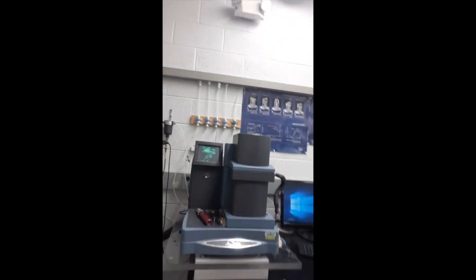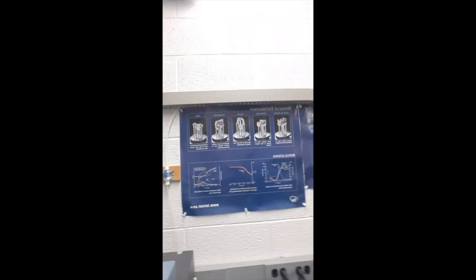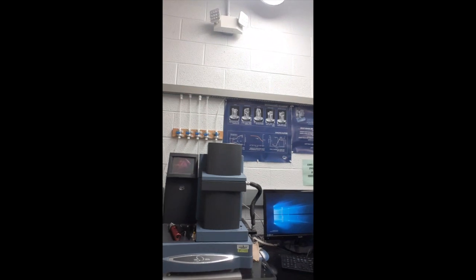Another instrument that I like to use is called our DMA, or dynamic mechanical analysis. Similarly, this can go up to higher temperatures and lower temperatures, and it can test different materials and different modes of mechanical behavior. Some examples are above. We see modes of deformation. We have cantilever bending, three-point bending, tension, compression, and shear. We like to use these not only for room temperature materials, but also for evaluating material properties at higher temperatures.